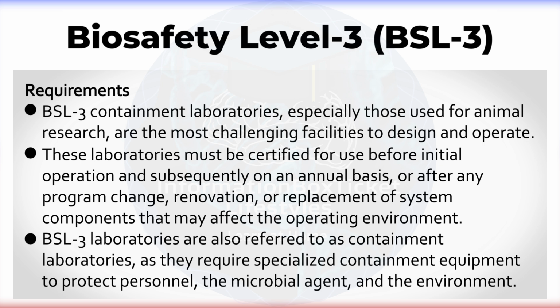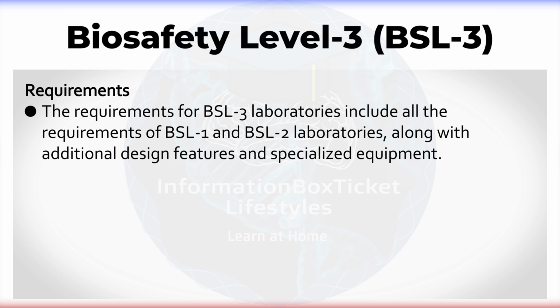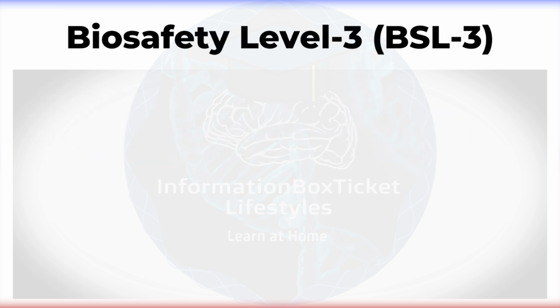BSL-3 laboratories are also referred to as containment laboratories, as they require specialized containment equipment to protect personnel, the microbial agent, and the environment. The requirements for BSL-3 laboratories include all the requirements of BSL-1 and BSL-2 laboratories, along with additional design features and specialized equipment.